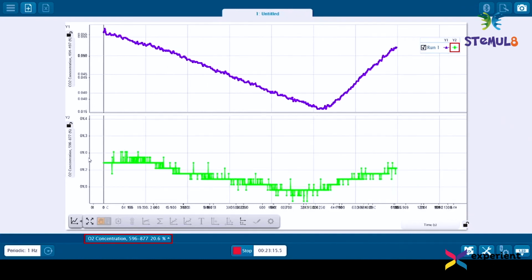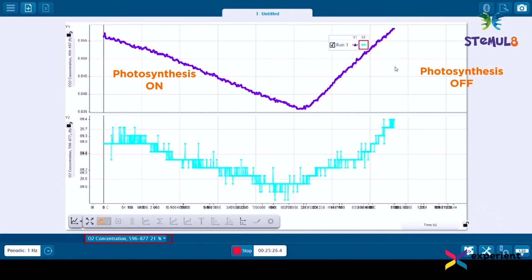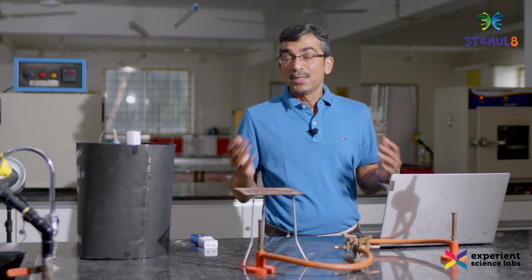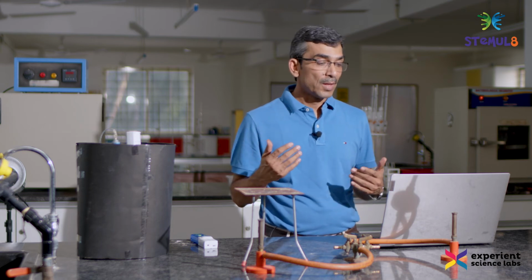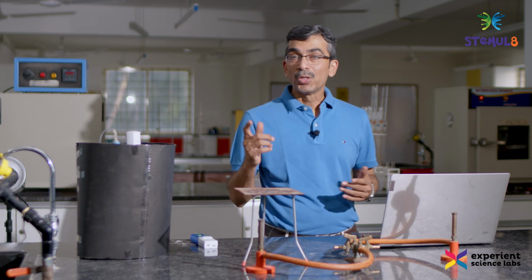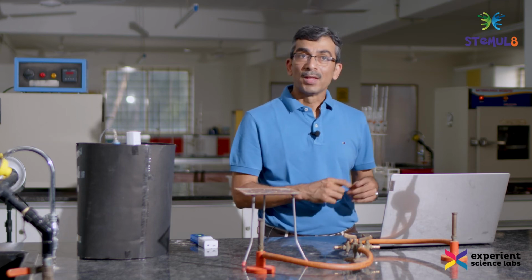And in terms of oxygen, it has also increased and almost started increasing at the same time, although the rate at which carbon dioxide was changing is different from the rate at which the oxygen level is changing, but the oxygen level has improved. Now this is something I was not aware of, and I was not expecting it. I was thinking that if the carbon dioxide level is going up, then the oxygen level should come down. But if you know the answer as to why this is happening, please let me know in your comments, and enlighten us as to why you think this is happening.